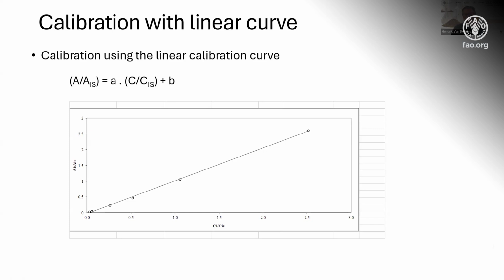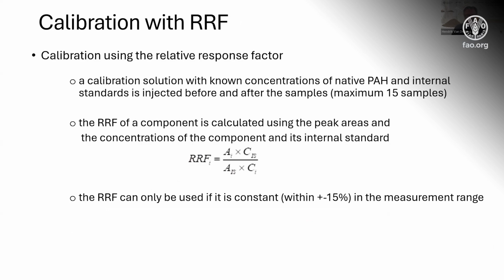Mostly the baseline is correct in the software, and the peak area is tabulated by the software. So the software does the integration of all the peaks and attributes a certain peak area to that peak. I don't have an example of this, but I think people who know chromatography know what I mean with peak area.